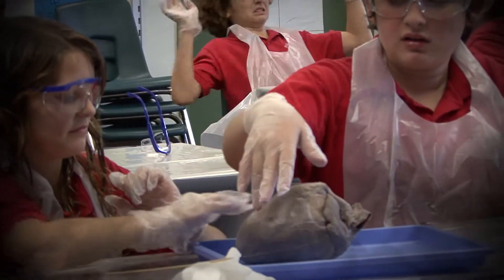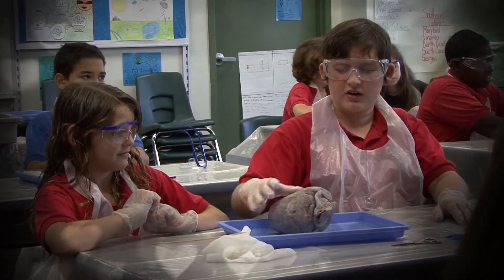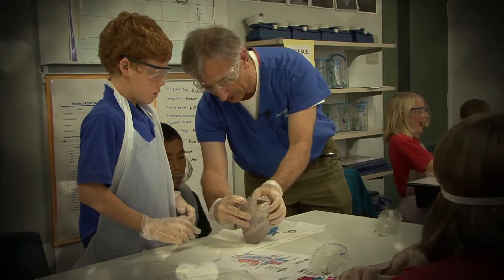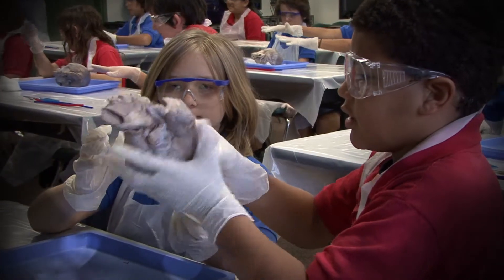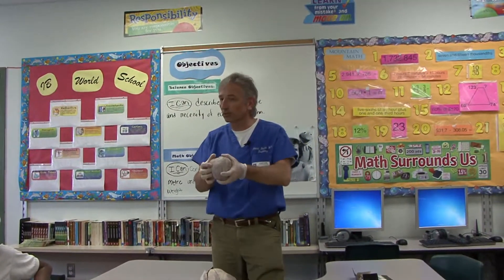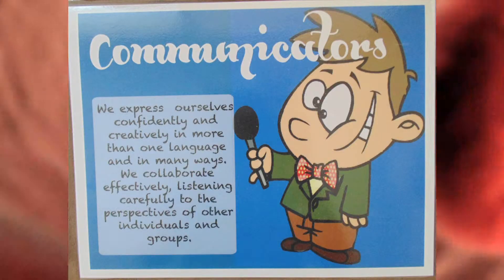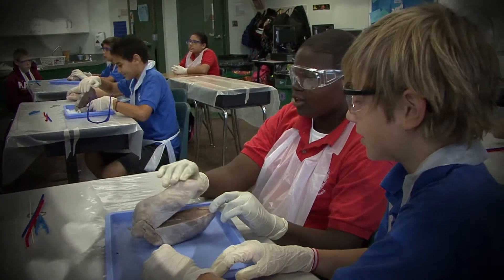The right side is going to be a little softer. The reason is because the left ventricle has to pump blood out to the entire body. The right ventricle is smaller because it only has to pump blood from the heart to the lungs. Go ahead and open.